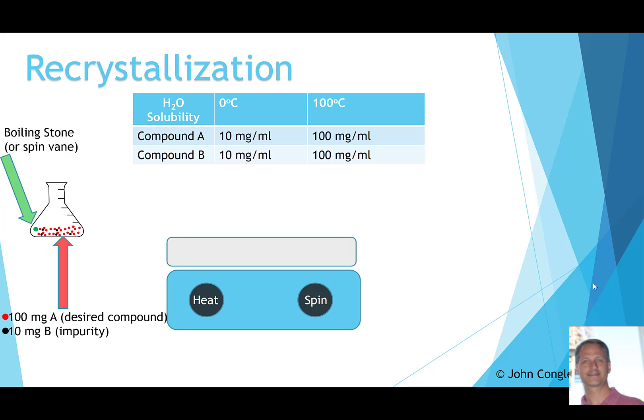We have an Erlenmeyer flask, which we typically use for recrystallization. In it, we have a mixture of 100 milligrams of compound A — the compound we're trying to purify — and 10 milligrams of an impurity, compound B. Before starting, we need to add a boiling stone or spin vane and pre-wet it with about a quarter milliliter of solvent so we don't risk melting our solute by placing it on the hot plate without any solvent.